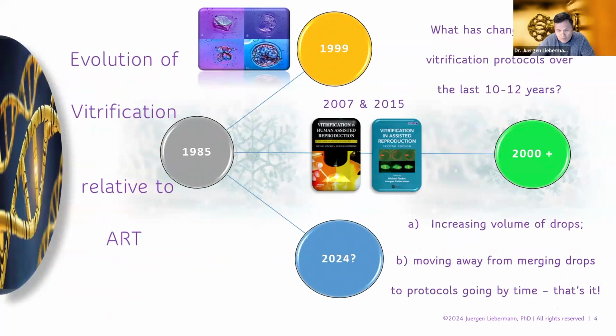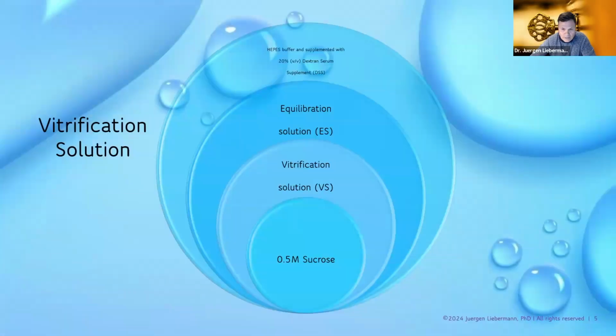But if we look at the protocols, we didn't really change much. We increased the volume of the drops, and we moved away from merging the drops, and that's pretty much it. Our solutions, in contrast to this, are still the same.